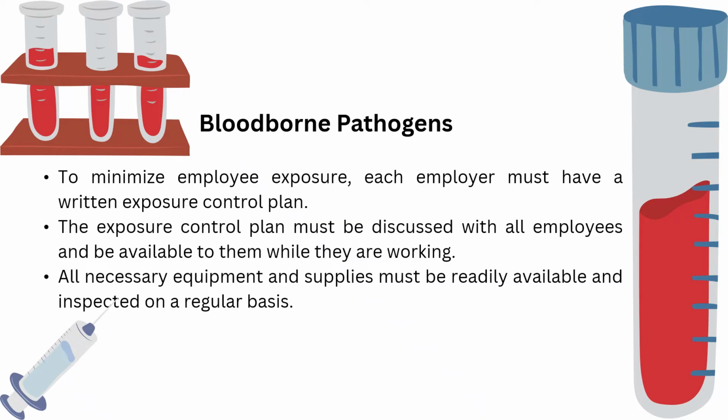Clinical laboratory personnel are knowingly or unknowingly in frequent contact with potentially biohazardous materials. So, in recent years, new and serious occupational hazards to personnel have arisen, and this problem has been complicated because of the general lack of understanding of the epidemiology, mechanisms of transmission of the disease, or inactivation of the causative agent. Special precautions must be taken when handling all specimens because of the continual increase in the proportion of infectious samples received in the laboratory.